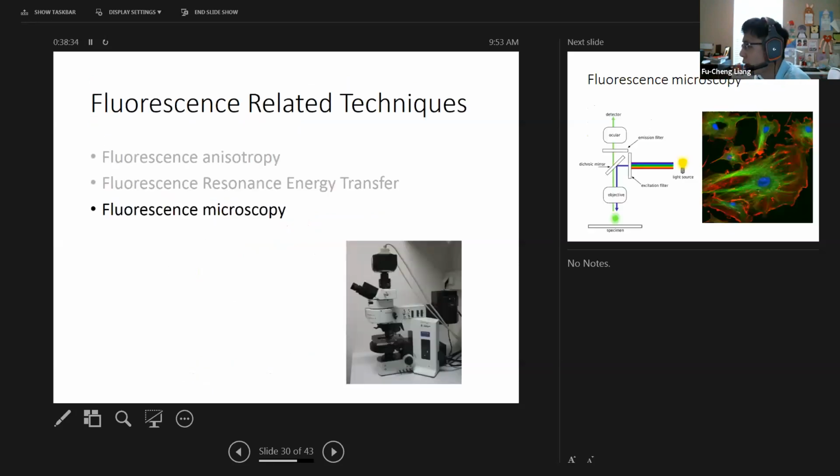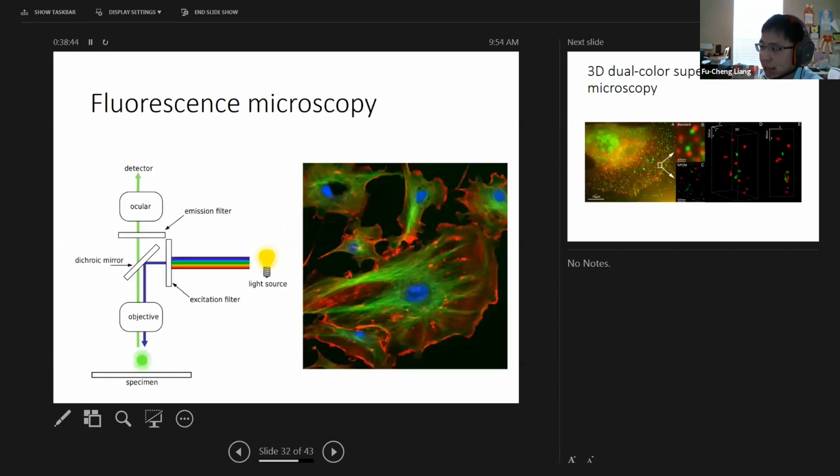All right, so the last one is the fluorescence microscope, all right? Fluorescence microscopes have been widely used. Of course, you can see that they can visualize some living cells. They can put a sample, a specimen, labeled with, for example, an antibody with a fluorescent dye, and then they are able to look specifically at the cell, and they can even see the nucleus, all right? So people have widely used it nowadays. They can even do single molecule imaging in a living cell.